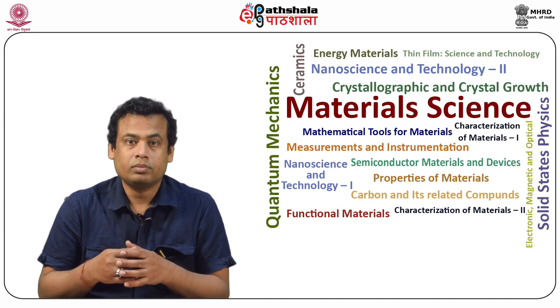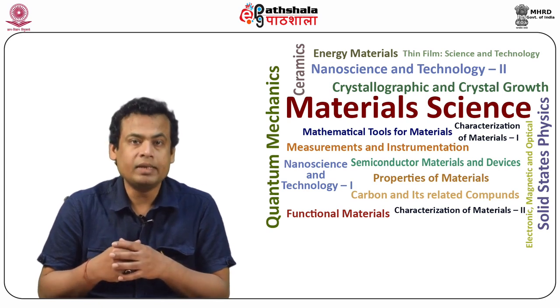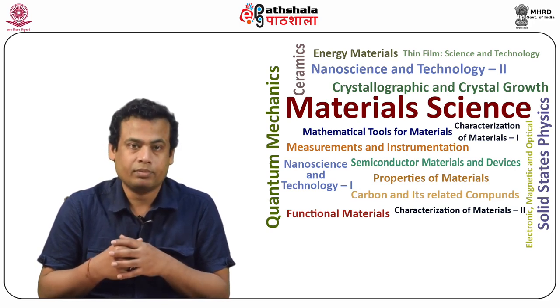However, determination of roughness, step heights, and feature size can be addressed using atomic force microscope, stylus profilometry, or optical profilometry.